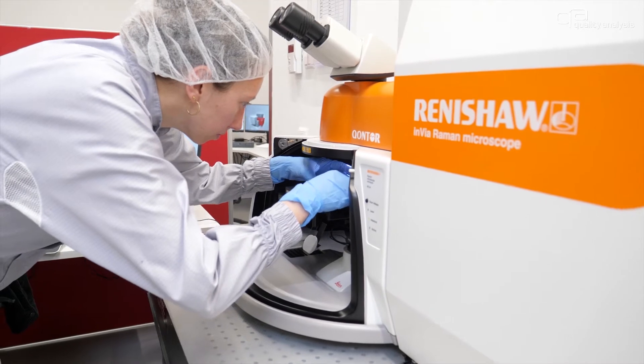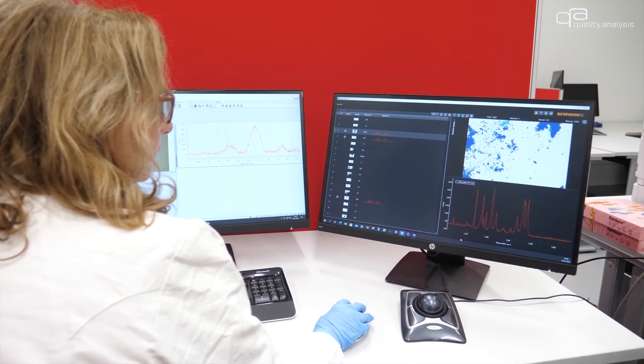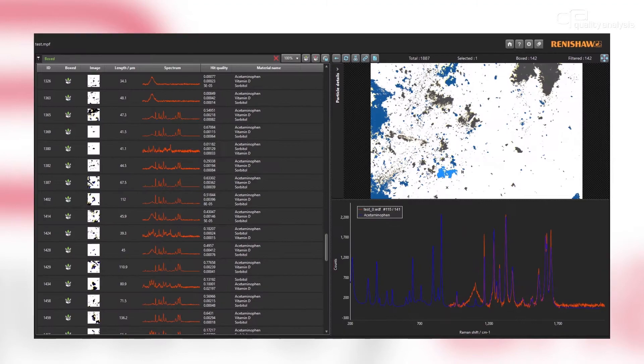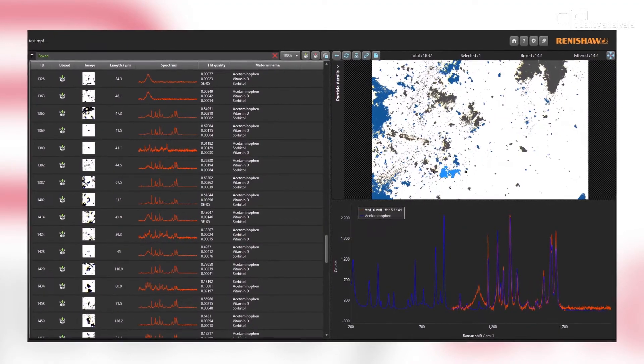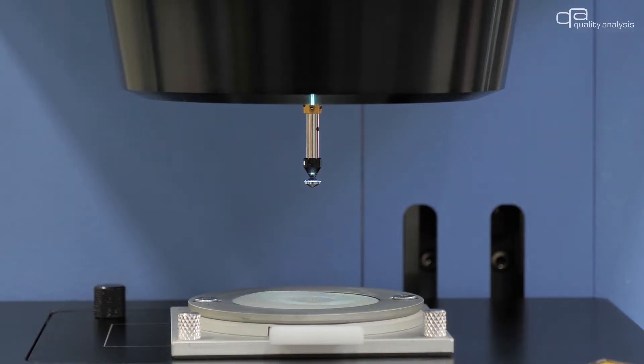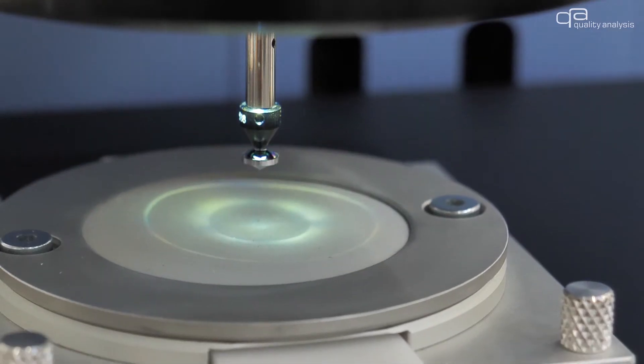Through fully automated analysis using Raman spectroscopy we identify organic particles, fibers and polymers. Raman inactive particles are analyzed by FTIR.